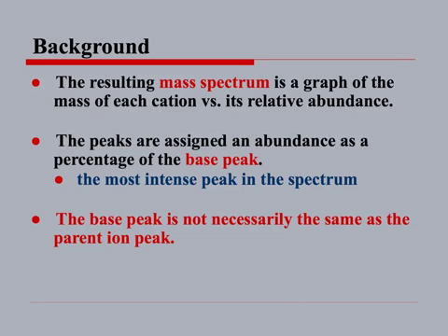Remember two terms: base peak and parent peak. Parent peak is the biggest molecular weight in the spectrum. Most probably it is the molecular weight of the whole molecule. Many times the intact molecule, without being fragmented, also forms a parent ion, and it may not form the parent ion all the time, but many times it has a parent ion, which is the whole molecule together, and it has a charge. There can be a peak related to that, but it may not be the highest intensity peak. The high intensity peak may be something which broke out from the parent ion, and it forms the highest intensity peak. So base peak and parent peak can be different.